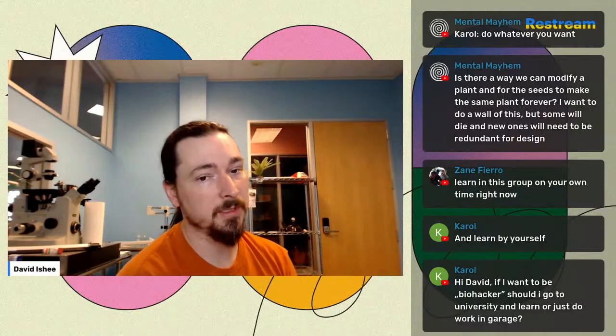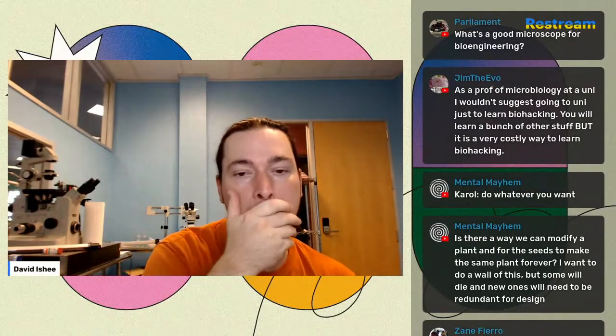So most of the time what you end up doing is tissue culture. For plant tissue culture, you can imagine you take some of these red cells, these modified cells, and you punch them out, put them on a dish, and then you give them hormones that revert them back into stem cells. And then you give them more hormones that make them develop leaves and stems, and then more hormones that make them develop roots. And then you clone that whole thing. You grow a brand new plant that's all those cells. And there's ways to make that more efficient, right? You can do things like antibiotic selection, drug selection.